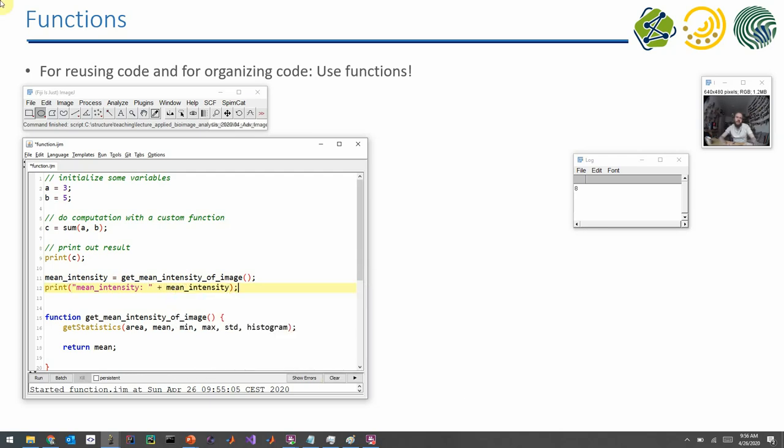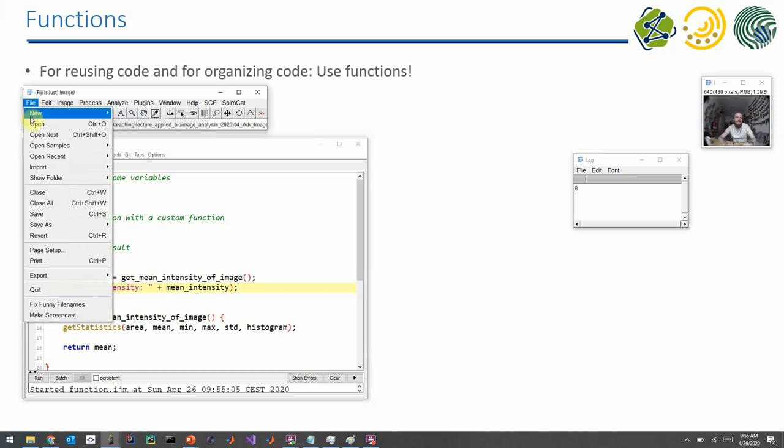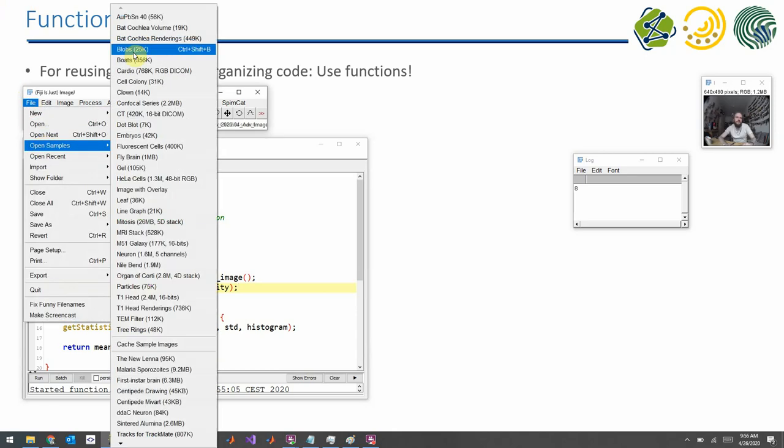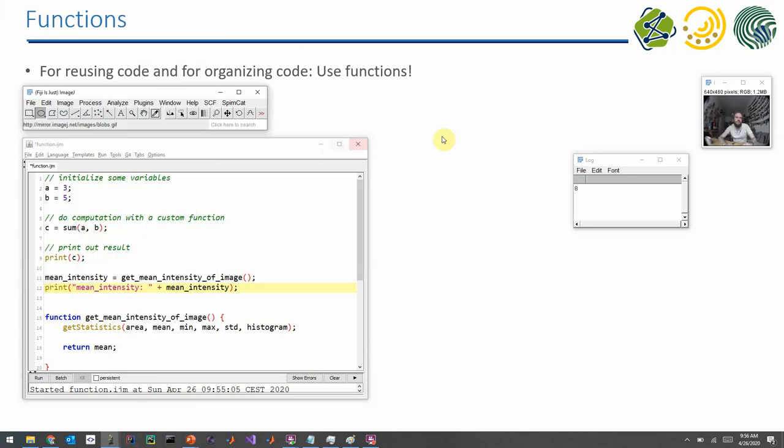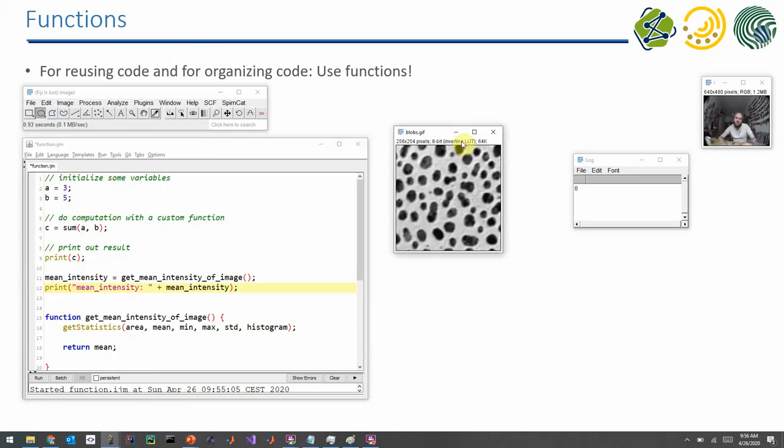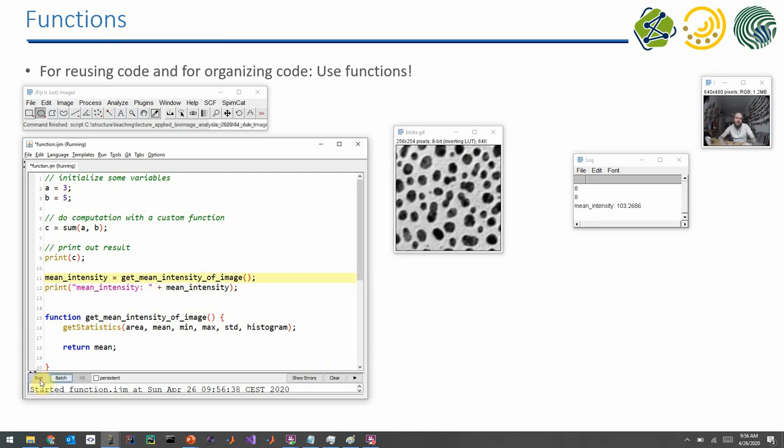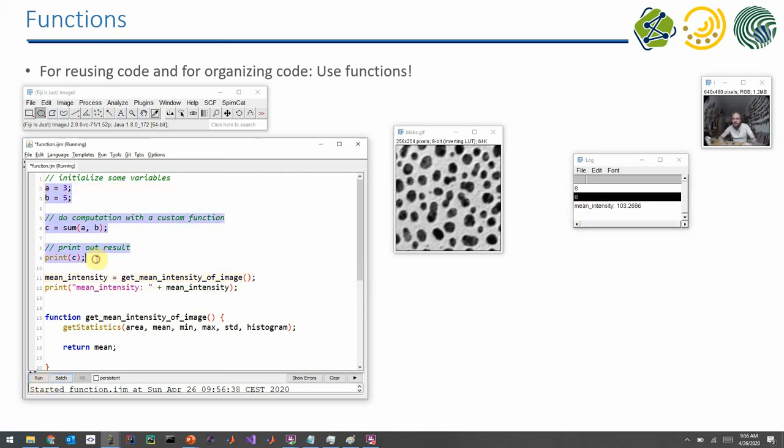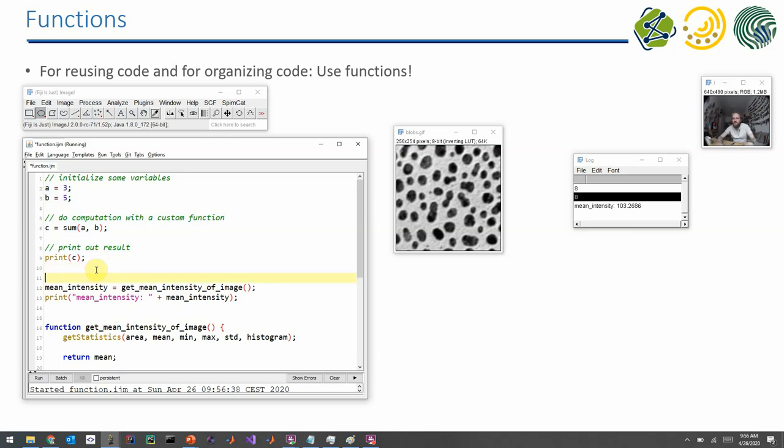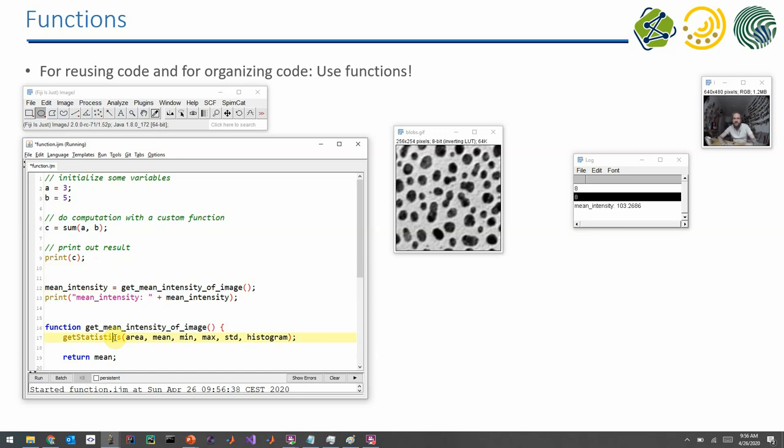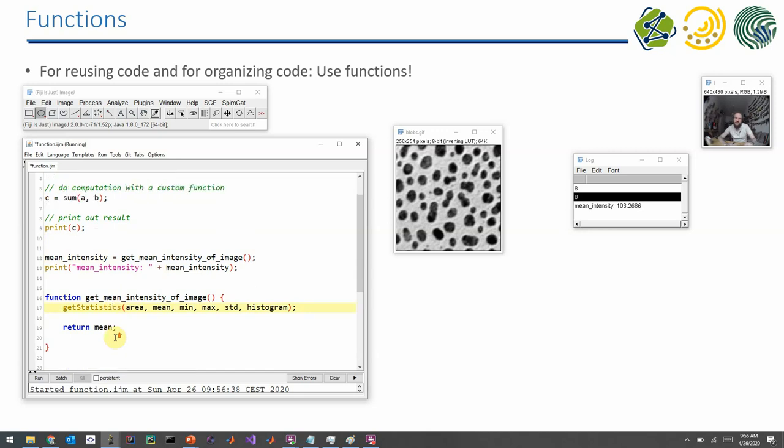So this is what makes functions so practical, right? And therefore I need an image. And if I execute this program, it again outputs the number 8 because it's still calculating the sum for me. And afterwards it outputs the mean intensity because it calls the get mean intensity method.